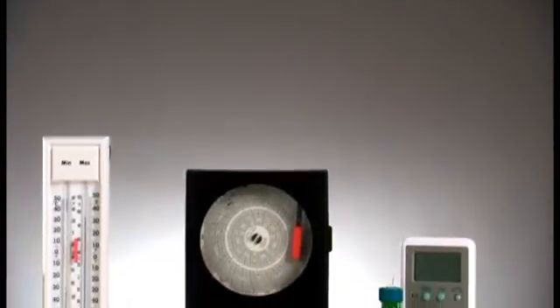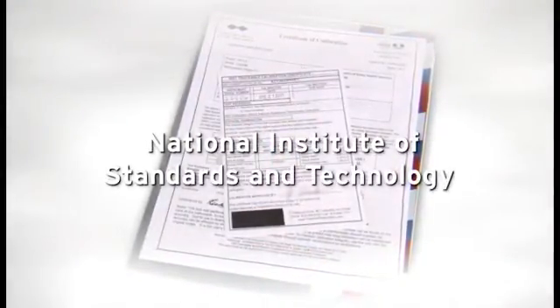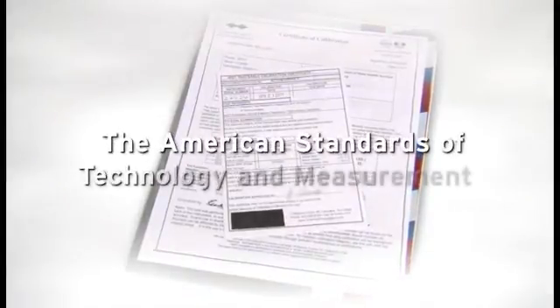Monitoring the temperature of your refrigerator and freezer is a critical responsibility. In order to monitor the temperature properly, you need high-quality, accurate thermometers. It is important that the thermometer you use is certified. Certified means that in addition to the calibration all thermometers receive during manufacturing, a second individual calibration is made against a reference standard set by agencies like the National Institute of Standards and Technology or the American Standards of Technology and Measurement.